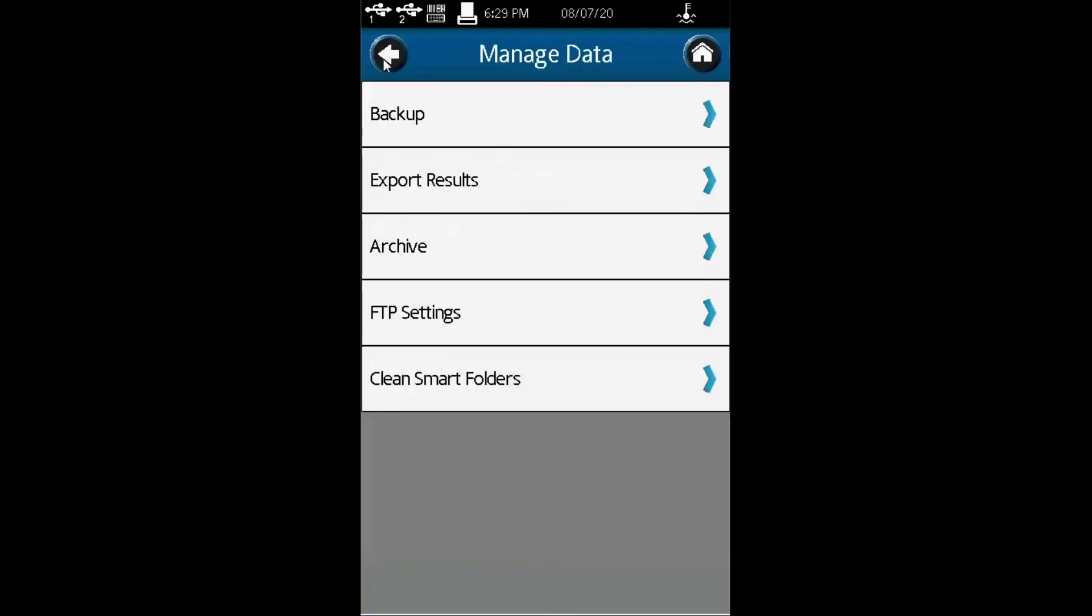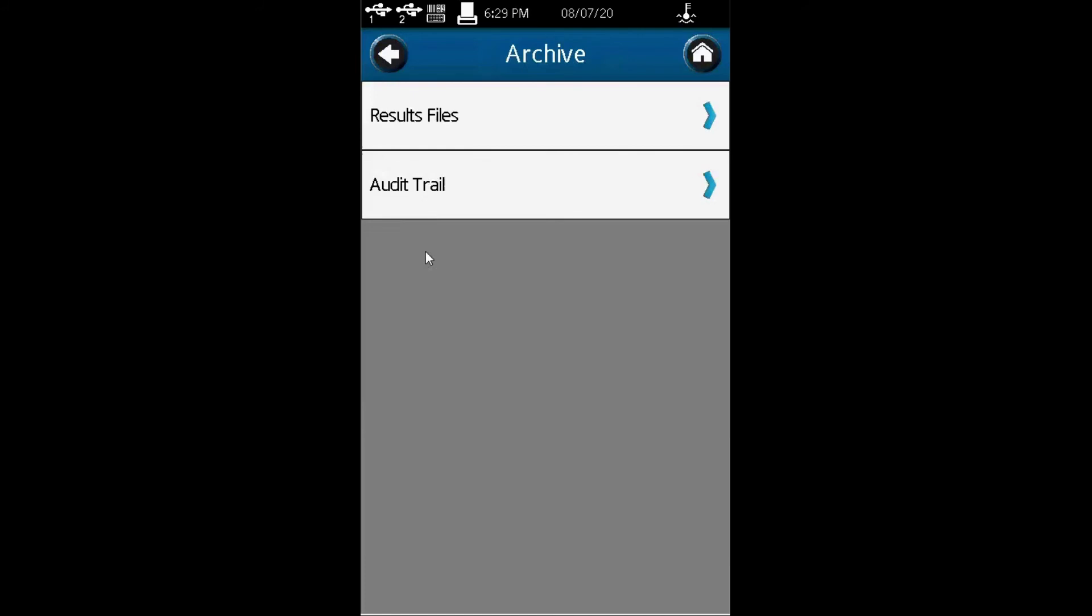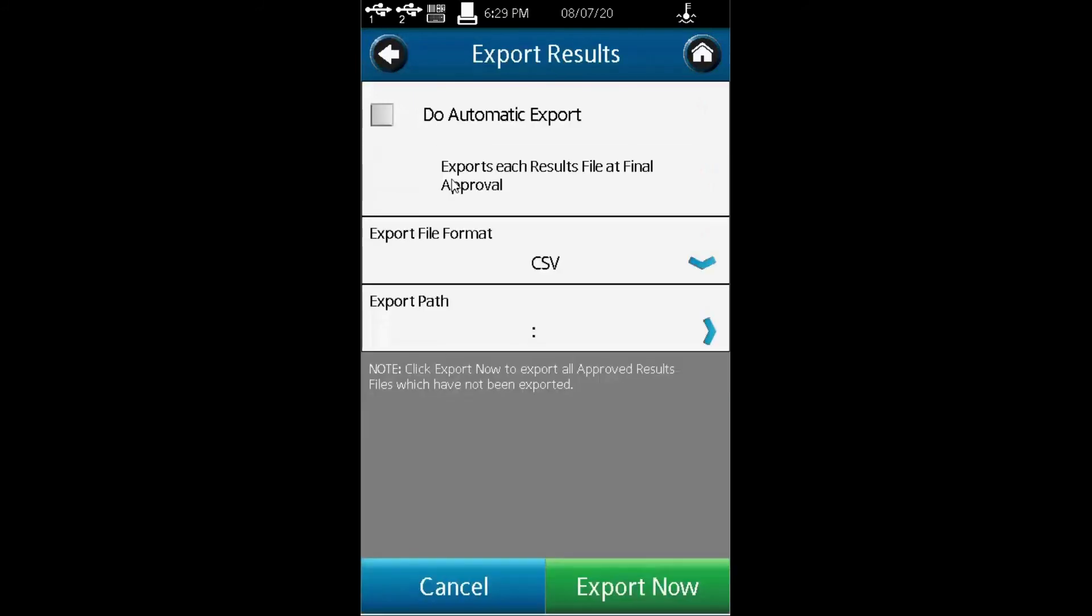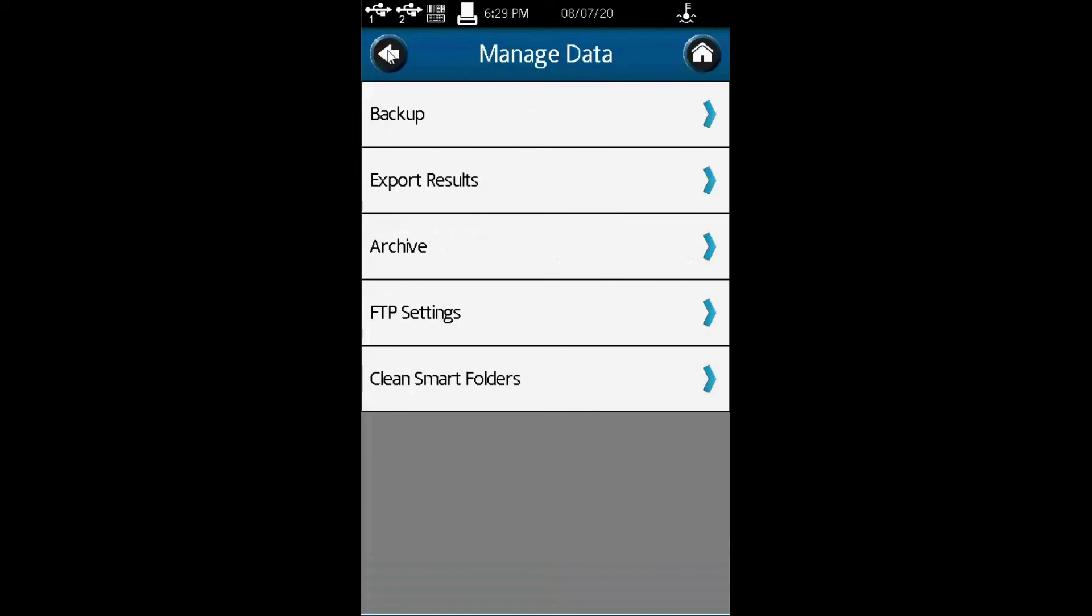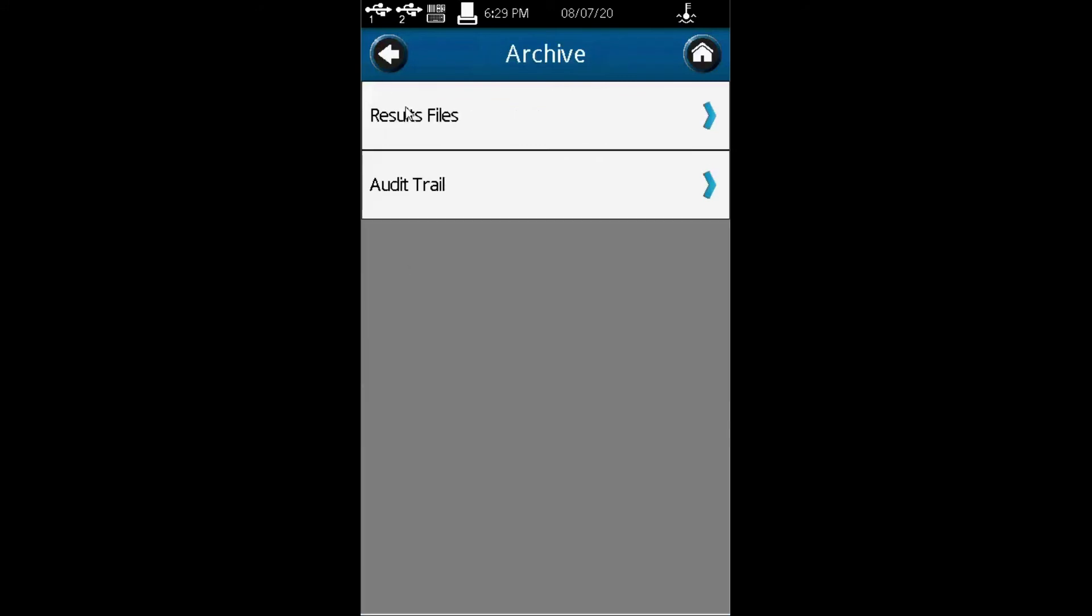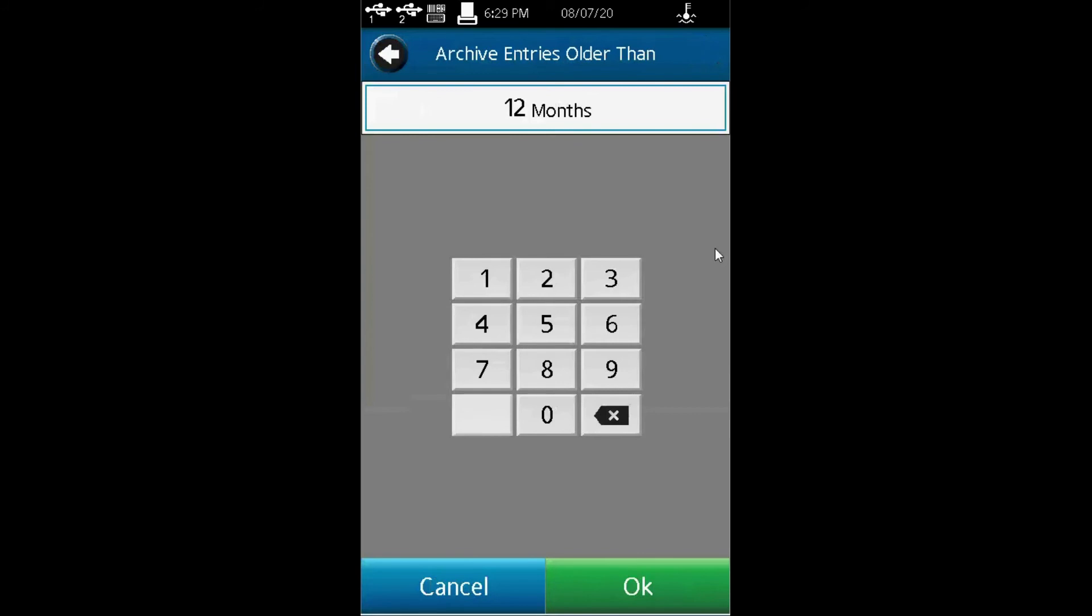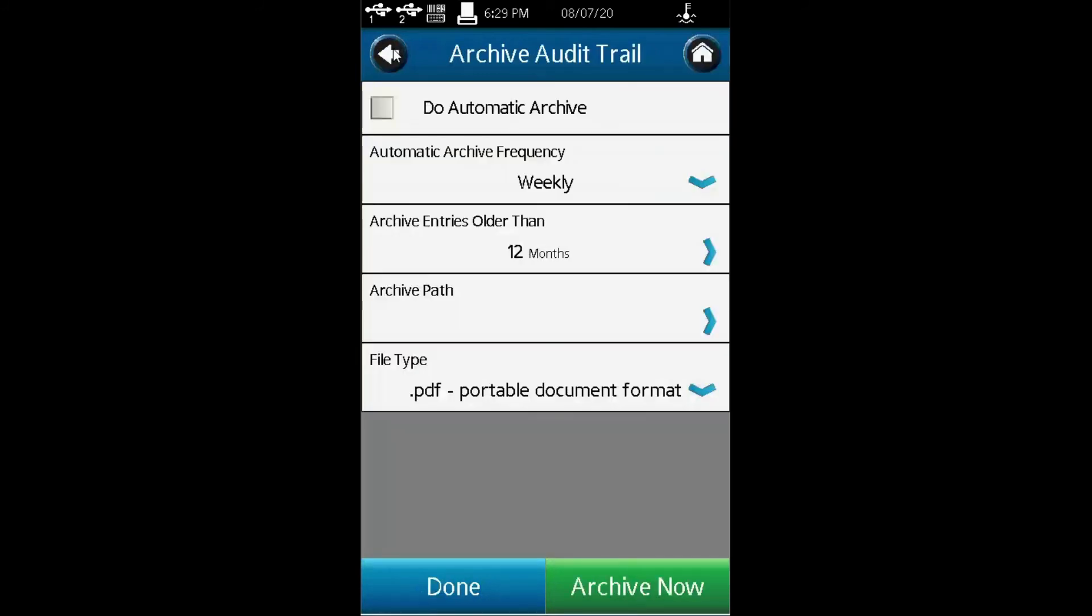When you do a backup export results, you can give them a path. You can also archive. For audit trail, you decide where you want to archive your audit trail and how long you want to archive them. For 12 months, or just for two or three months. You have the flexibility as a user to determine how you want to archive your audit trail.